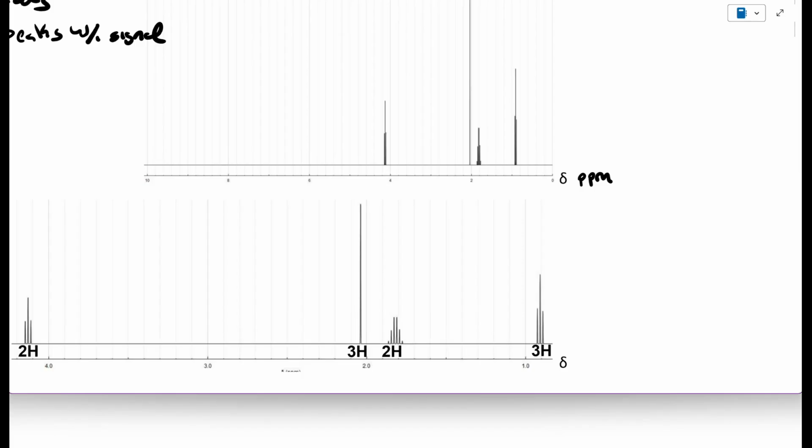That's pretty common. That's a standard workhorse NMR, and that refers to how strong the magnet is. But 400 megahertz is also pretty common. 500, 600 is a little more powerful, a little more expensive, and so you can have all sorts of ranges of magnet strengths. But on every magnet, the amount of energy needed to flip the spin is slightly different.